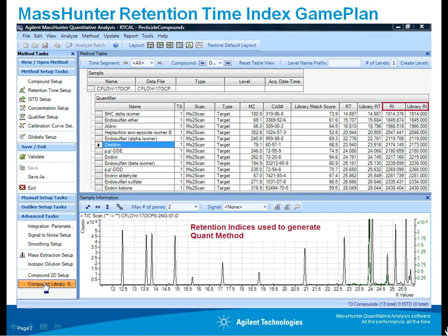And if we broaden this picture out, you can certainly say that mass spectrometry with spectral matching is quite useful. But there can be confusion because spectra look similar. So by combining both the spectral match as well as the retention time match, that drastically improves the hit quality of library searches. So the question that we're going to face here is, how do we keep those retention times lined up with the library?